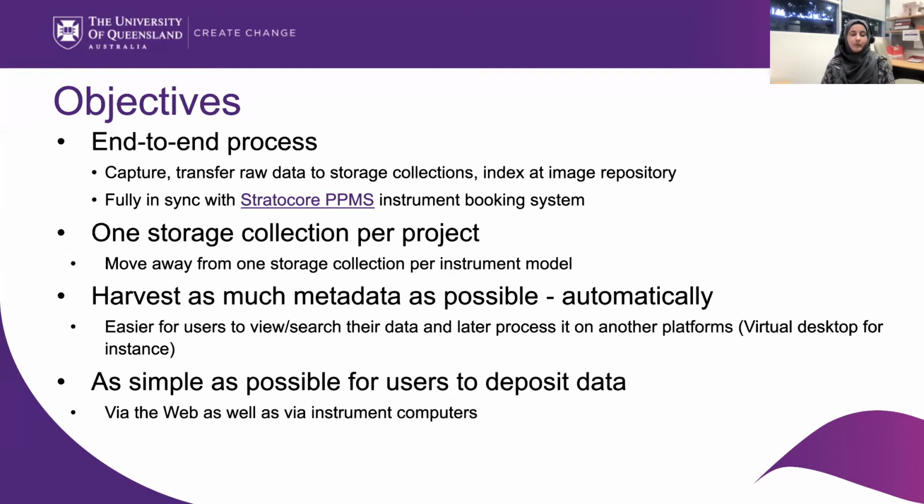Then, because we are running a project-centric approach in CMM, the storage collections were previously with the instrument files. This was the change we made: the storage collection needs to be per project. The good point about that is, for example, if I do a PhD in 6 years, all my 6 years of data from any instrument within UQ should be accessible in one place, in one collection. So this is how we finalized.